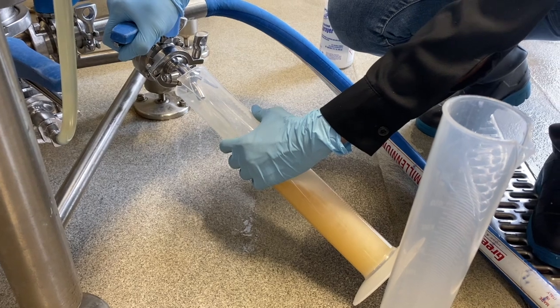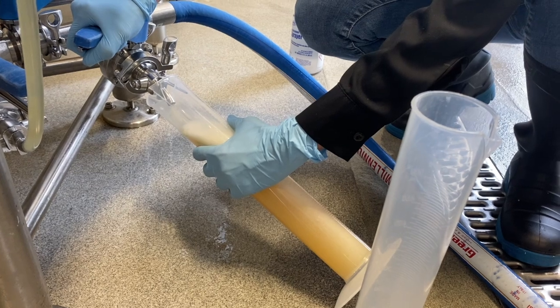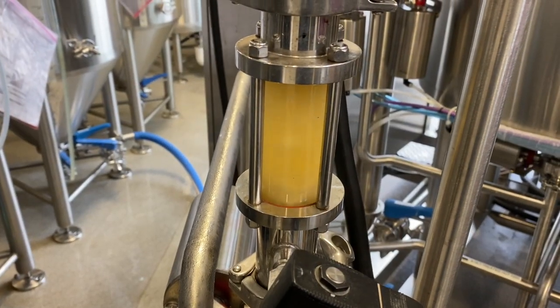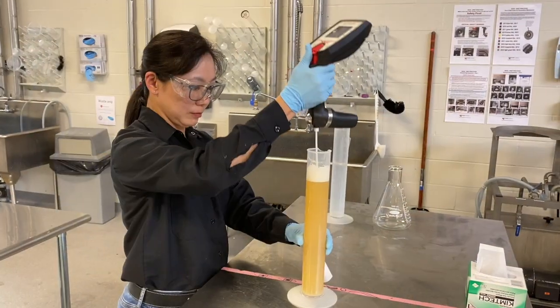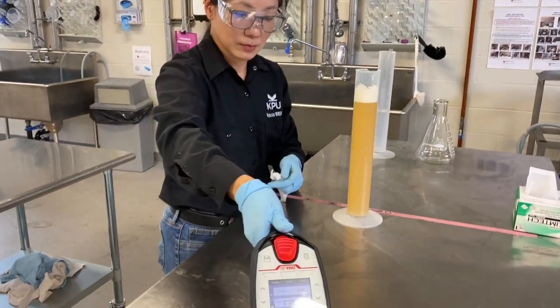Collect about half a litre of cooled wort sample on its way to your fermenter into a sanitized 1 litre container. Make sure that the wort sample is well oxygenated. Then measure the original extract of the wort.